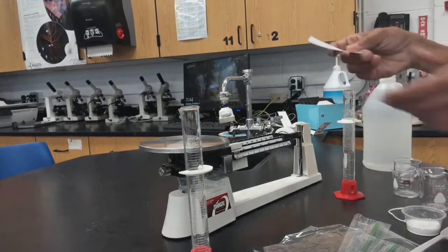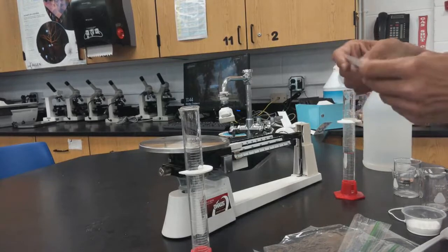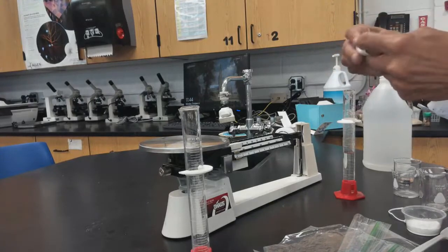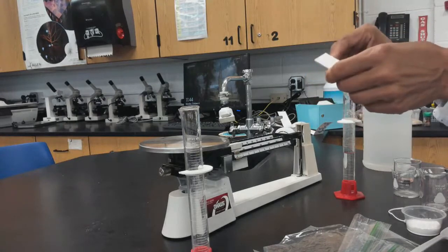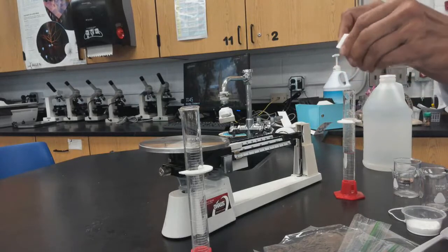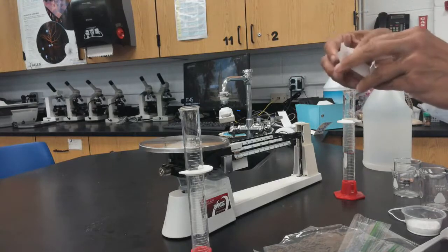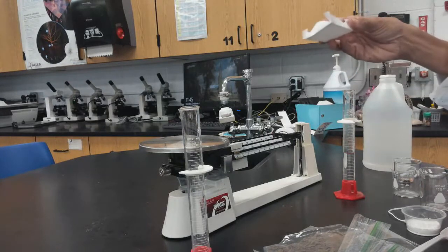The first thing you need to do is create a weigh boat. Take an index card and fold the four sides to prevent material from coming out. This prevents material from falling off the scale, which would alter your mass measurement.